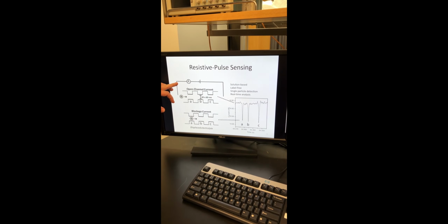measured 3 times. Hi everybody, my name is Dee, and this is the focused ion beam instrument that we use to make our nanofluidic device. The middle column is the one we use for scanning electron microscopy to help us find our samples. And back here we can control a very focused beam of gallium ions, which can sputter the materials off our substrate surface to make the patterns that we design. We can also do depositions with this gas injection system. With that, we are able to make various nanostructures.